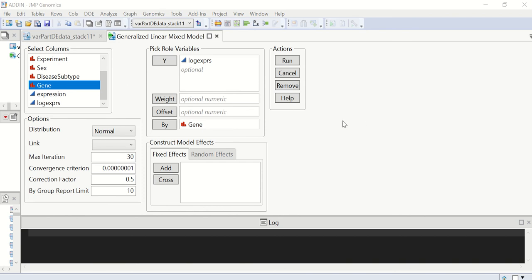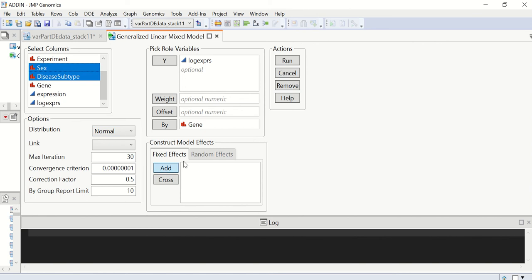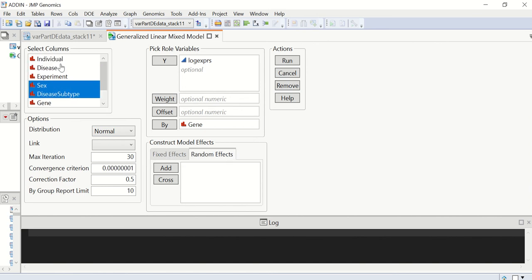Next, we specify the fixed effects and the random effect. Click on run.